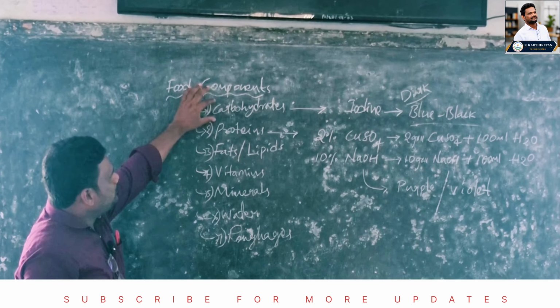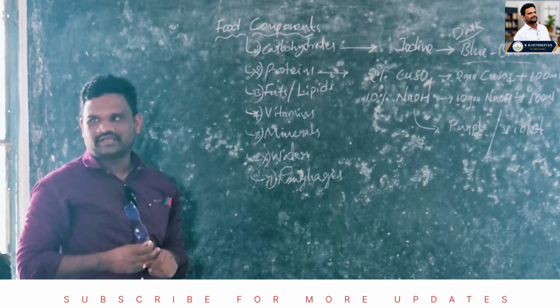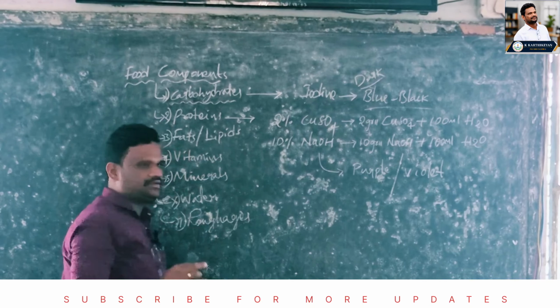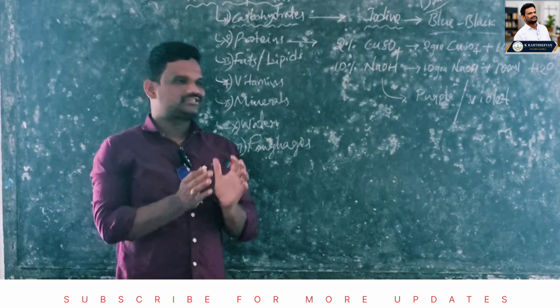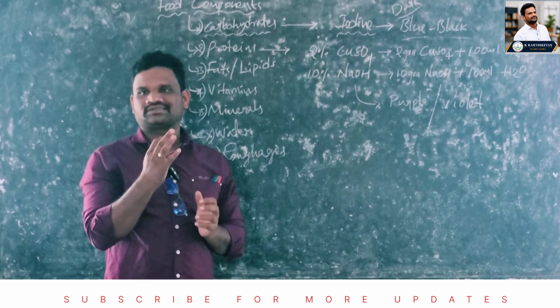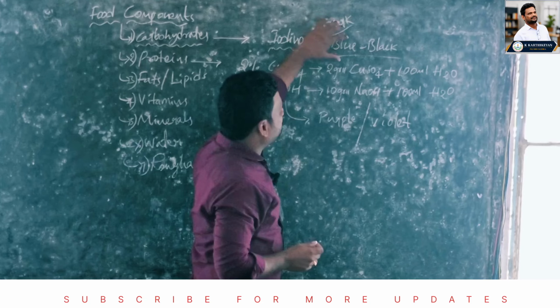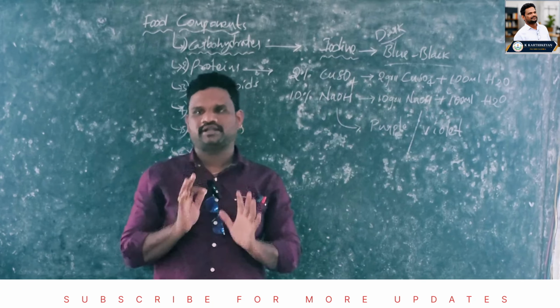Now let us see how carbohydrates are confirmed by an experiment, how proteins are confirmed by an experiment, and how fats or lipids are confirmed by an experiment. For the carbohydrate experiment, we need one reagent, that is iodine. Iodine reacts with the carbohydrate and converts to a dark blue or black color, which means if the food material reacts with the iodine and forms dark blue or black color, it is confirmed that the food consists of carbohydrates.